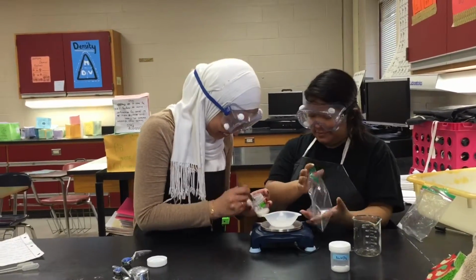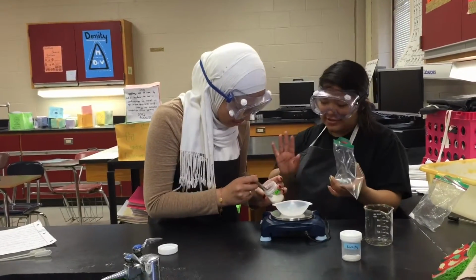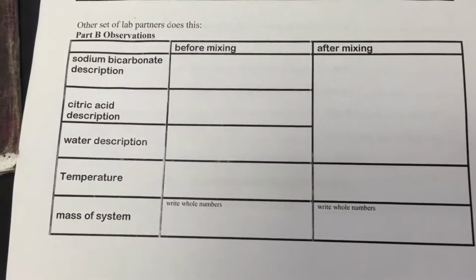Now while they're doing that, remember that this is how your data table should look for part B.